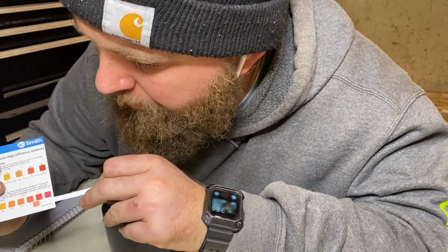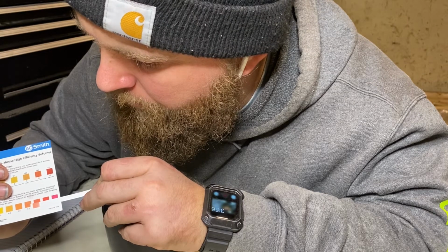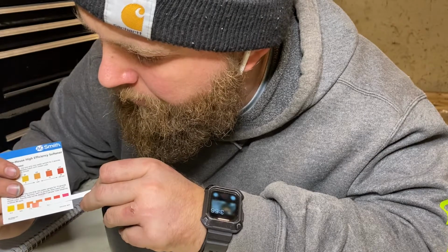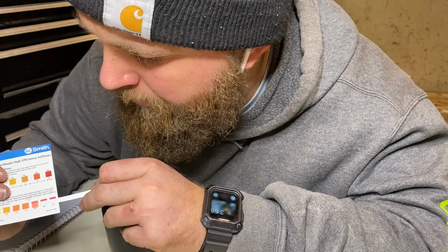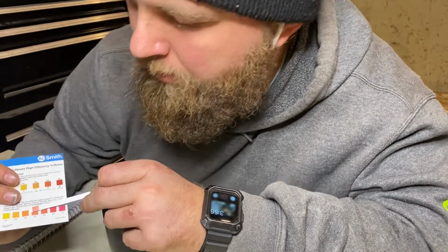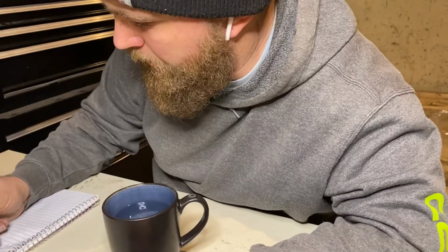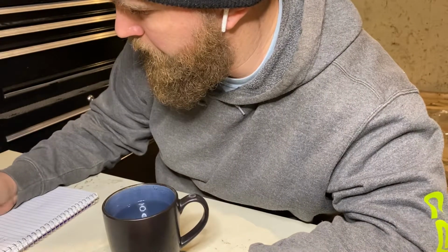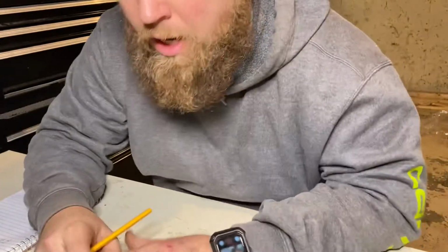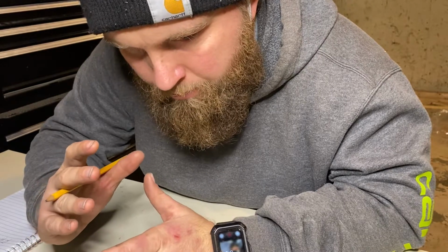All right, been about 15 seconds. Now we're matching up. We're somewhere here between 7.5 and 8. Somewhere in between there. It's definitely a lean on 7.5. So I'm just gonna write 7.5 because that's the one that's closest to. pH 7.5. All right. So now we know our numbers. We did our test and we're ready for the next step.